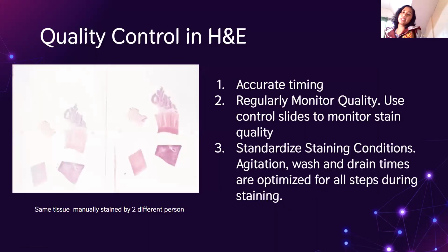So finally guys, ito, quality control in H&E. So I just want to show you yung mga kailangan bantayan, okay? So since hindi pa natin alam, hindi pa tayo nag face to face guys, at least, 'di ba? Kailangan yung bantayan tong mga to. So example, same tissue manually stained by two different people. So class, it's very important na bawat station, there is accurate timing.